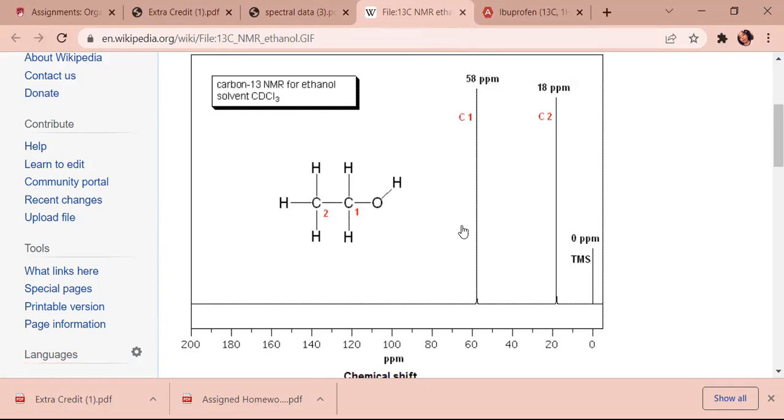So there's not too much to say about this, honestly. This one's a little bit higher, as you can see, but that's mostly just because it has more atoms surrounding it, versus this one only has like 3. This one has about 4, even though this one's not necessarily connected to it. It is there and it's surrounding it a little bit more. So that's why this one is a little bit taller, and then this one is a little bit more downfield just because it has something so electronegative next to it.